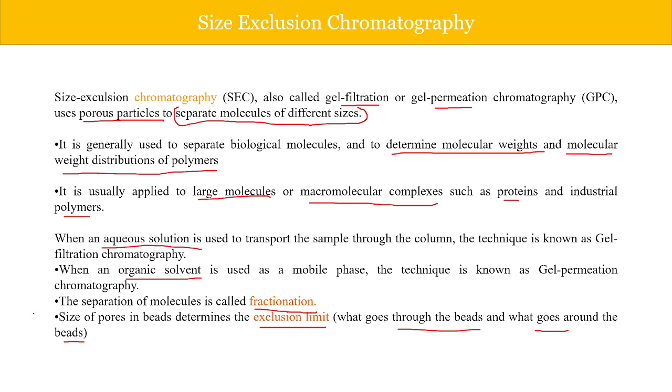So that limit determines this, and these beads have different sizes. The size tells us the story about molecular weight, as to how much molecular weight of the protein it can take in and how much it discards or lets flow through. Okay, so that is important. The costly instruments can purify proteins of higher molecular weights, like 100 or 200 kilodaltons, whereas some less costly instruments can purify only up to, say, 20 or 50 kilodaltons. That's all.